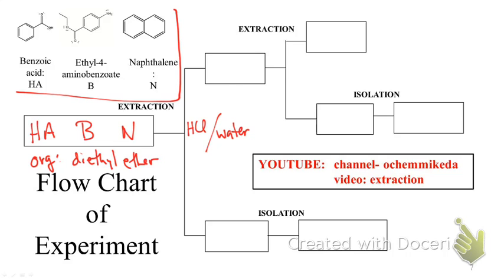What is HCl going to react with? A base. Which compound is our base? B. Probably B. That's why I picked these abbreviations. Okay? What happens if it acts as a base? It accepts protons. The structure ends up changing, and I get HB. Just HB, or should that be charged? Should be charged. Why should it be charged? It has an extra proton, which means the charge should be positive.